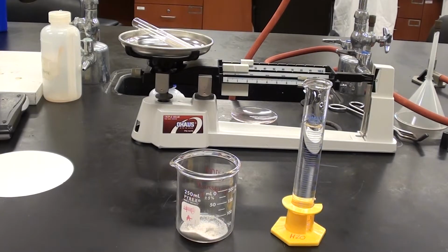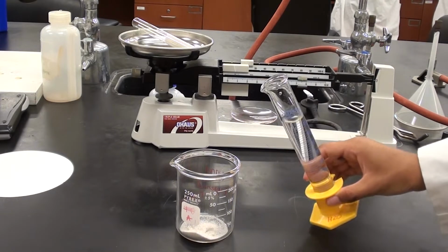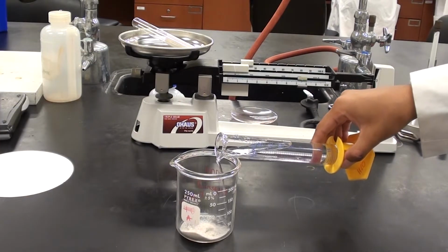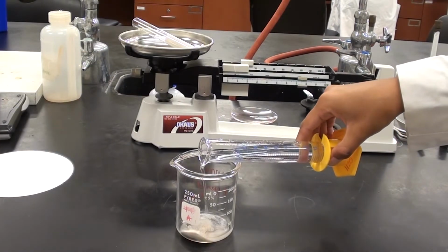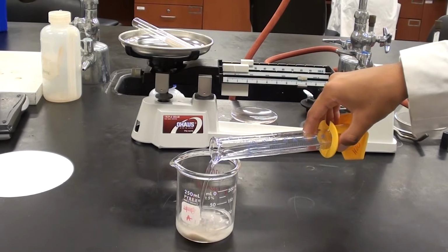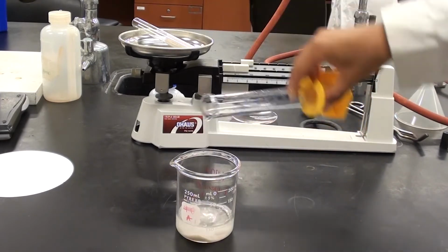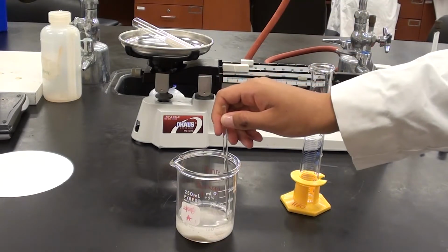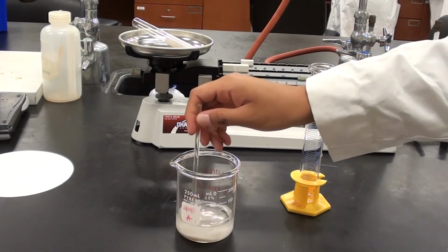The next step will be to dissolve this mixture, or attempt to dissolve it, into water. Obviously the salt will dissolve, but the sand won't. Sabrine, go ahead and add the water to the beaker. You'll notice there's about 50 mils of water in here, but it doesn't have to be exactly 50 mils, just somewhere in that ballpark. Add it all? Yes, add it all. There we go. That's good. Now she's going to stir it with a stirring rod, and she's going to do this for 5 minutes.